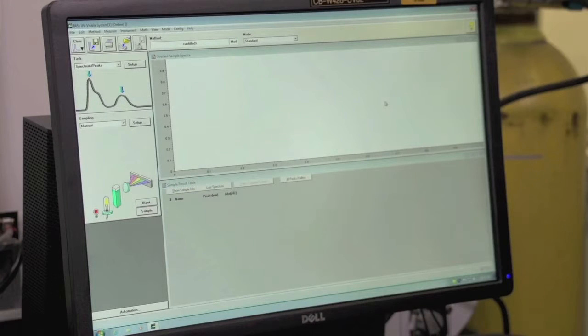Now that we're ready to collect our sample, go to the sample icon on the screen and just click that. The collection will begin.